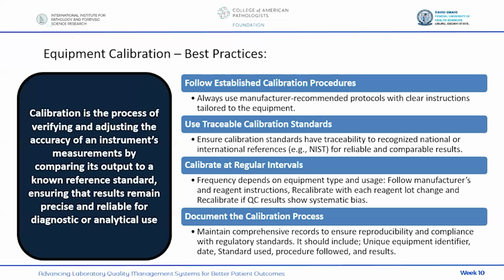And everything you do, of course, you must document. You must maintain comprehensive records to ensure reproducibility and compliance with regulatory standards. I know a lot of us do calibration. A lot of us calibrate equipment. But now the catch is, when you calibrate, what do you do at the end of your calibration? This is where this comes handy. What do you document as evidence that you calibrated or recalibrated an equipment?